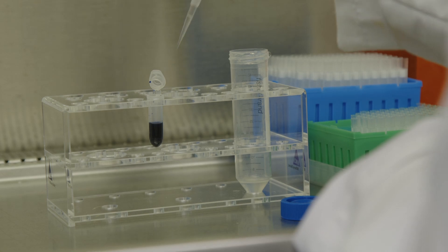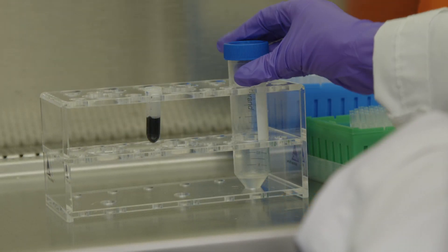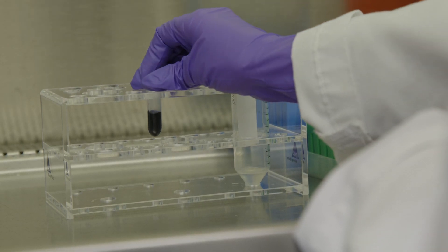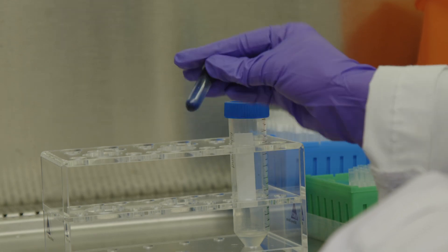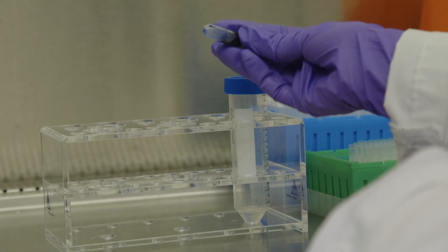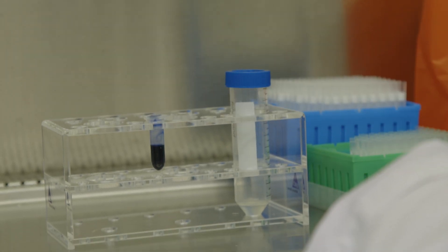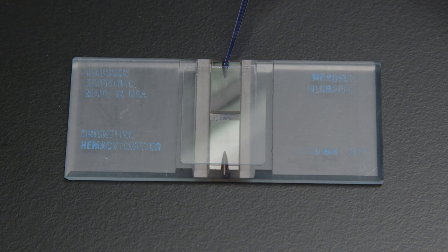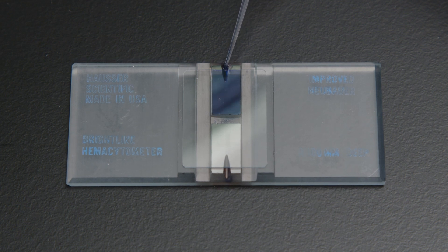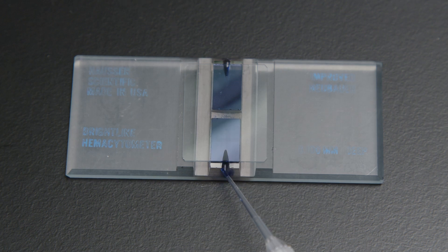When combined, the cells and medium should be mixed and incubated at room temperature for one minute. After the one minute incubation, mix the cell suspension to ensure an even distribution. The following steps must be done quickly to prevent cell death induced by trypan blue. With the cover slip situated evenly, apply a 10 microliter aliquot to each chamber of the hemocytometer and place it on the microscope.